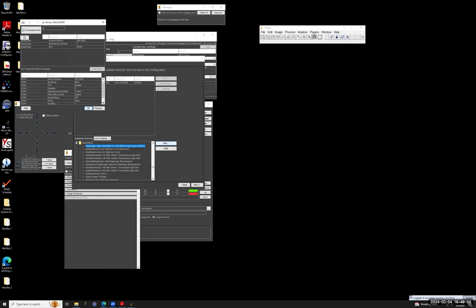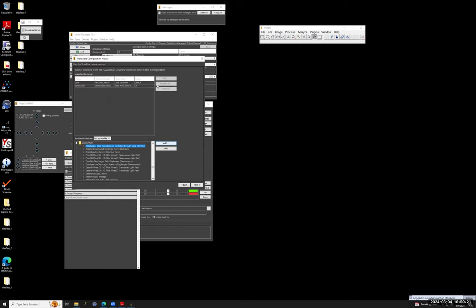And now there are a number of settings that I have to be a bit careful with, like for example which COM port it is connected to and what the baud rate is. I believe it has to be a specific value, which I'm not sure I remember correctly, but we will see. You can find all this in the documentation for the device adapter. So I remember I set it correctly.